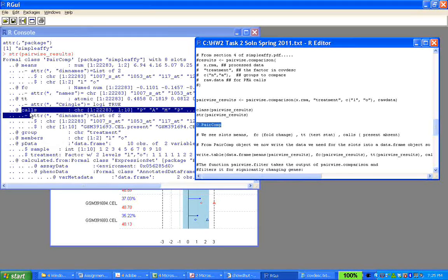So think of it like you start with basic objects like frame and matrix, and you build a relatively complex object. You do a lot of operations on that complex object, then you want to again filter down and bring that data back downwards into simpler objects like frame and matrix again.